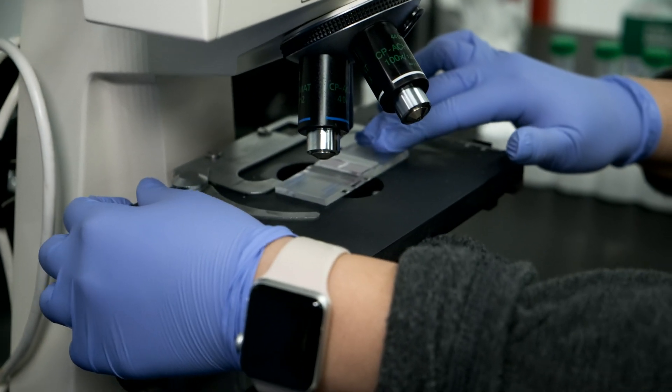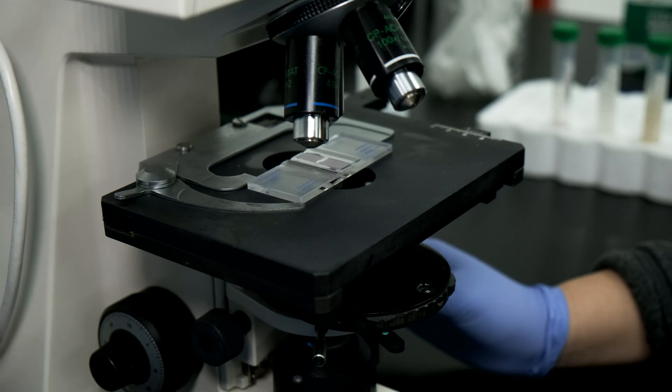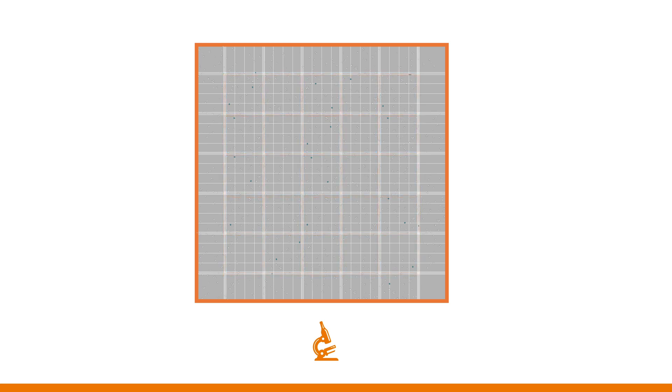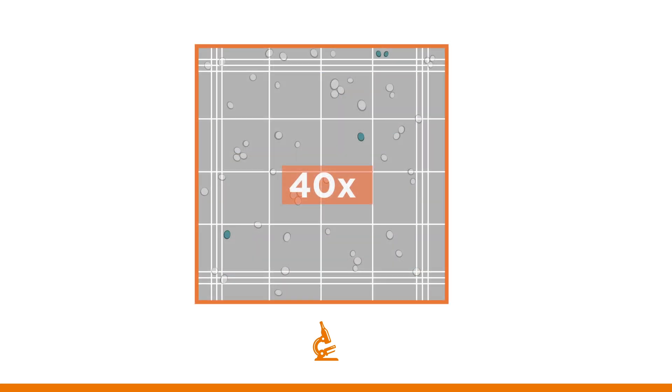Place the hemocytometer on the microscope stage and focus on the 10x objective. A 5 by 5 grid should now be in view with yeast cells spread out evenly. Once focused, move on to the 40x objective.